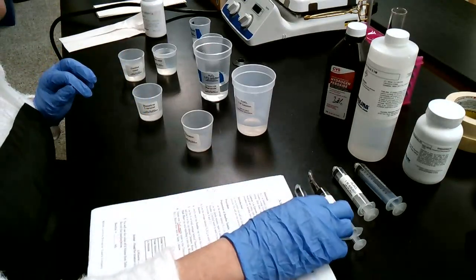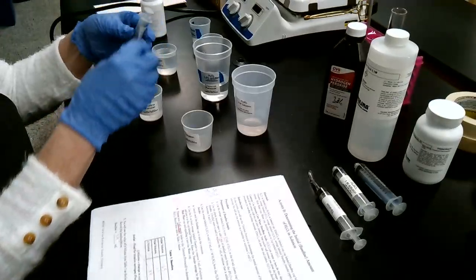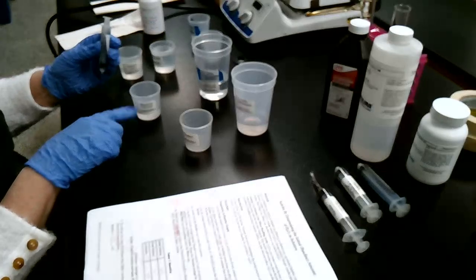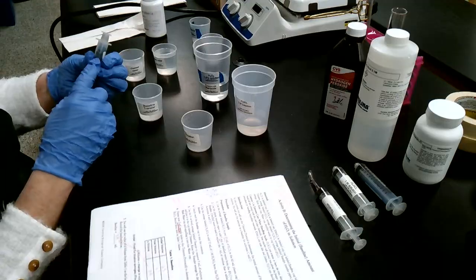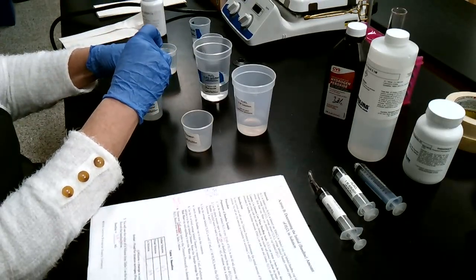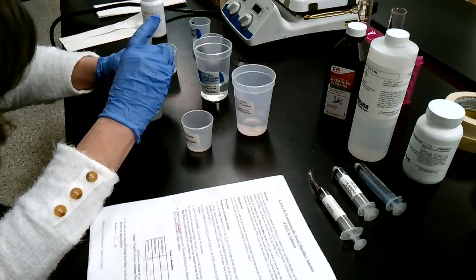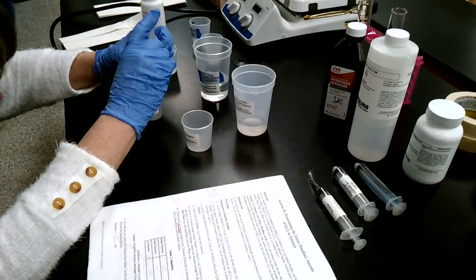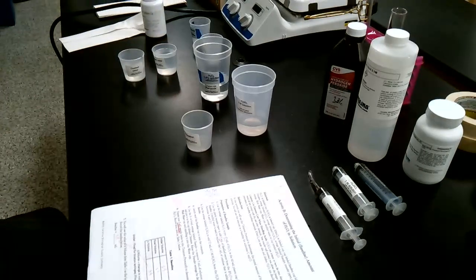But now you've got to transfer. So get your transfer syringe. You're going to take out only 5 milliliters because you don't want to titrate all of that. That's just too much to titrate. So you want to bring out only 5 milliliters of this mixture. I'm going to pull it up beyond the 5 and squirt it down to the 5. This is where you've got to be exact on your measurements. The more exact you are, the better it is. And be careful, remember, you've got acid in there. So I'm taking it down to my 5 mark.